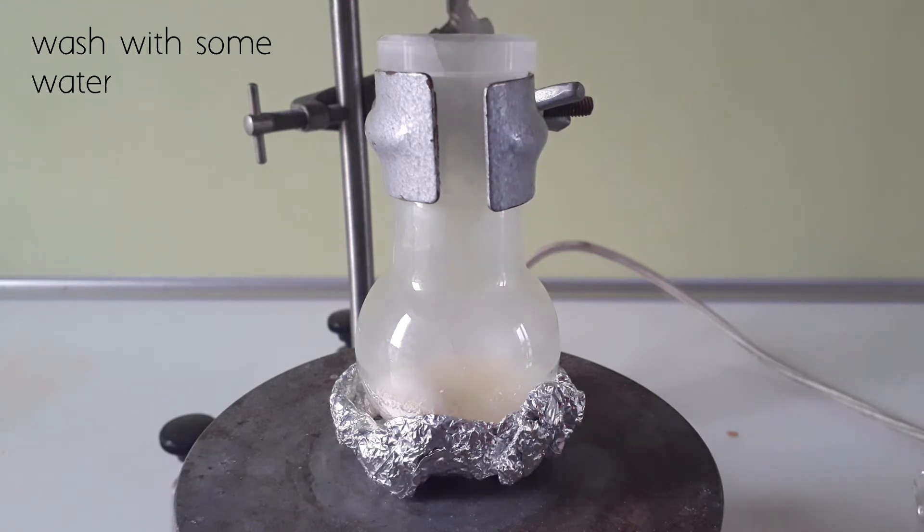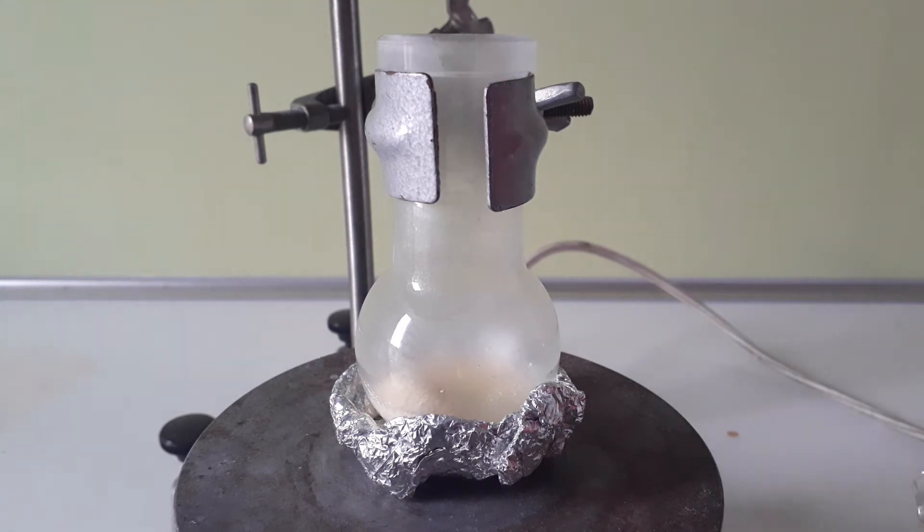On early attempts, the cerium dioxide just soaked in all the sulphuric acid and made a hard block which was impossible to stir.